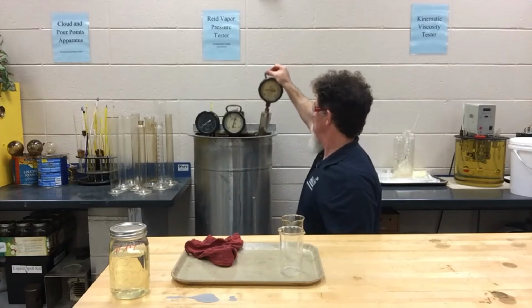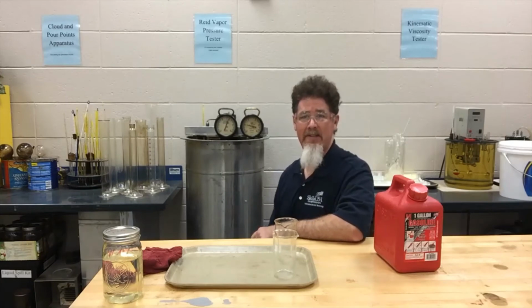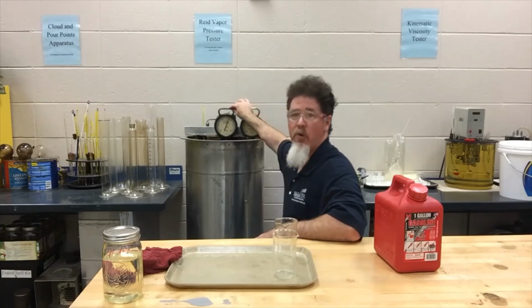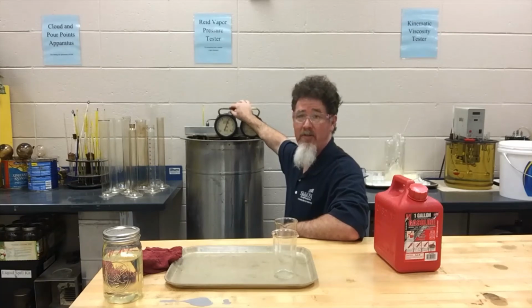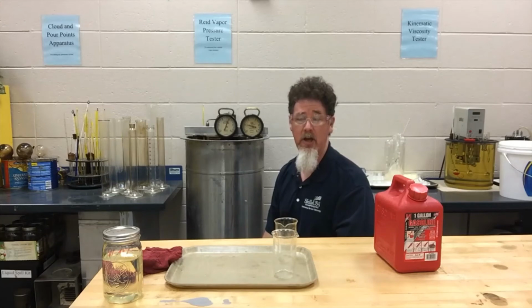We'll warm it back up again and give it a chance. So we'll come back one more time and take a look at the end results of this. We're back, and the end result on my 91 octane is about 8.7, 8.8 PSI. So the Reid vapor pressure of the 91 octane was the lowest that we had. The 89 octane, remembering, was 10.5 at the end result, and the 87 octane was 13.6. Out of those three samples, the 87 octane would be the best fuel for your lawnmower, as far as cold drivability, to have a volatile mix where the fuel is a vapor and it's able to ignite.